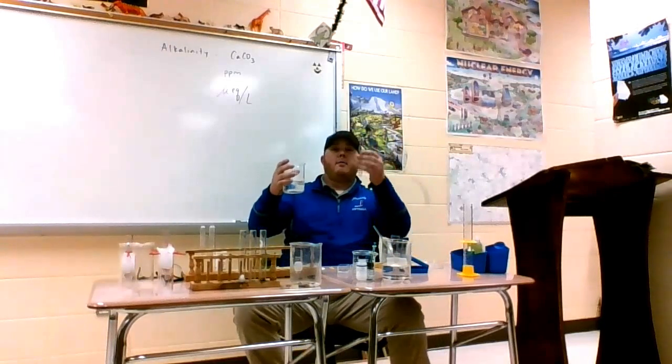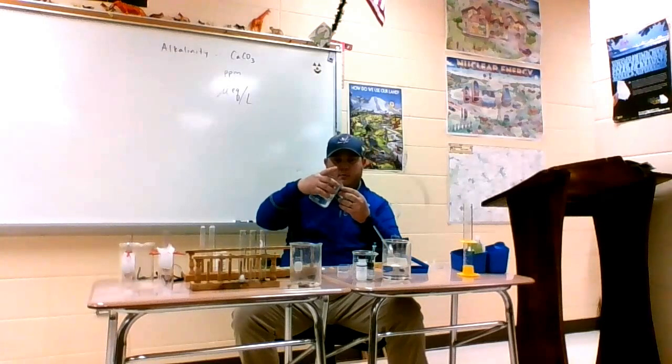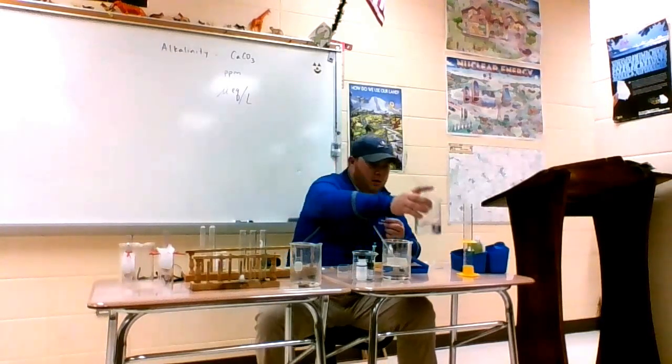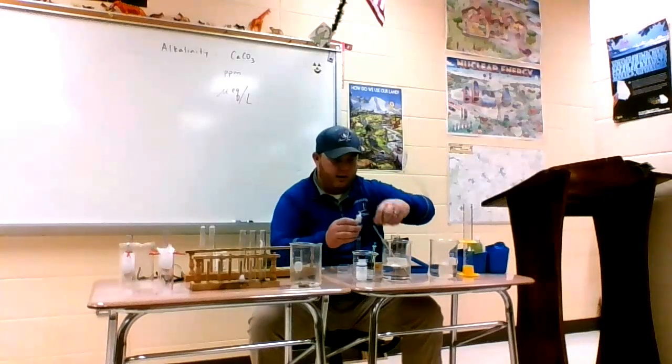So I'm going to take this sample. This is tap water. I'm just going to fill this up to 10 milliliters, just to get the pH. And I'll add 10 drops of the indicator.